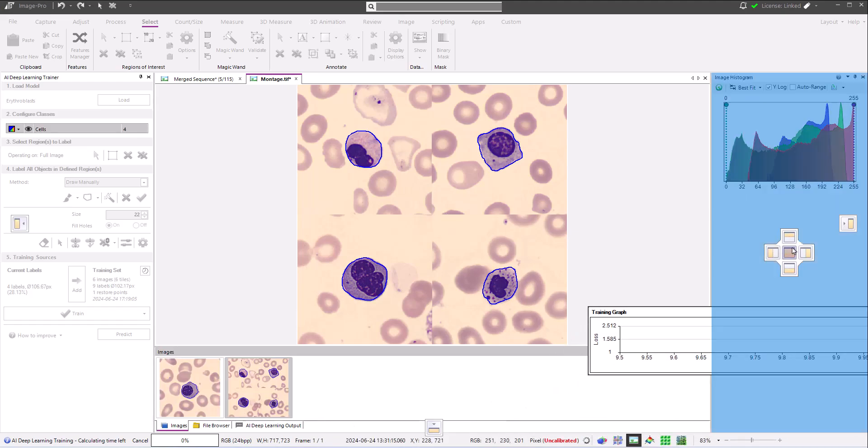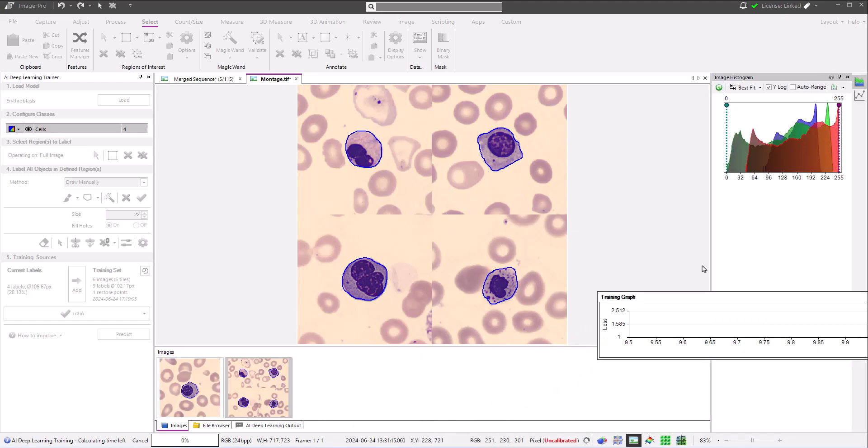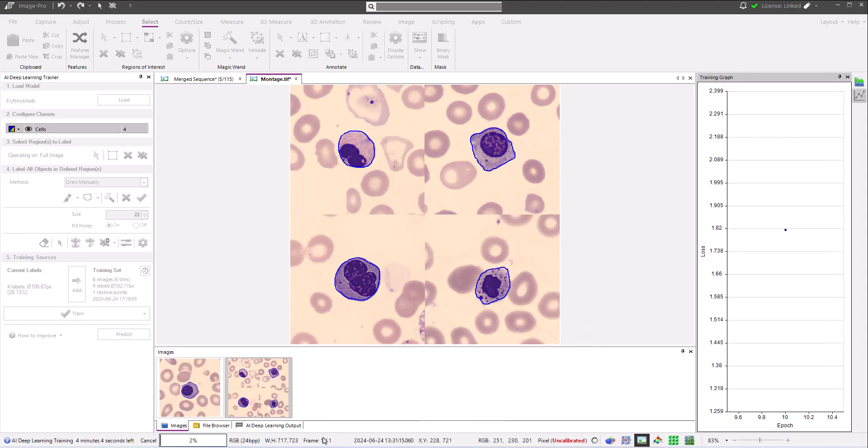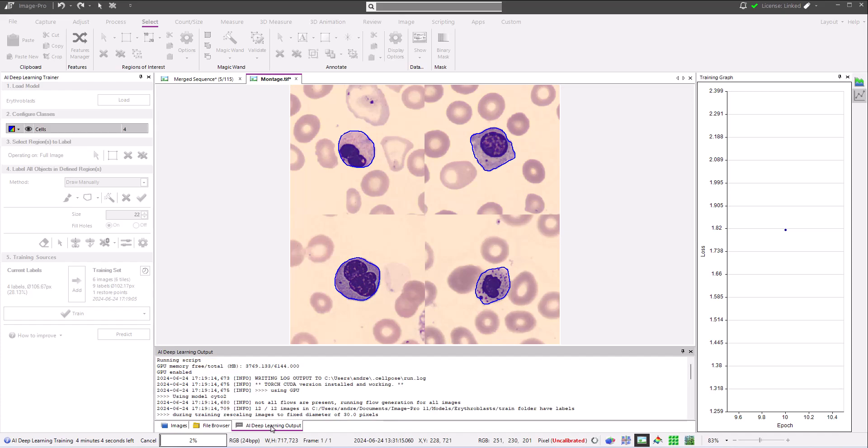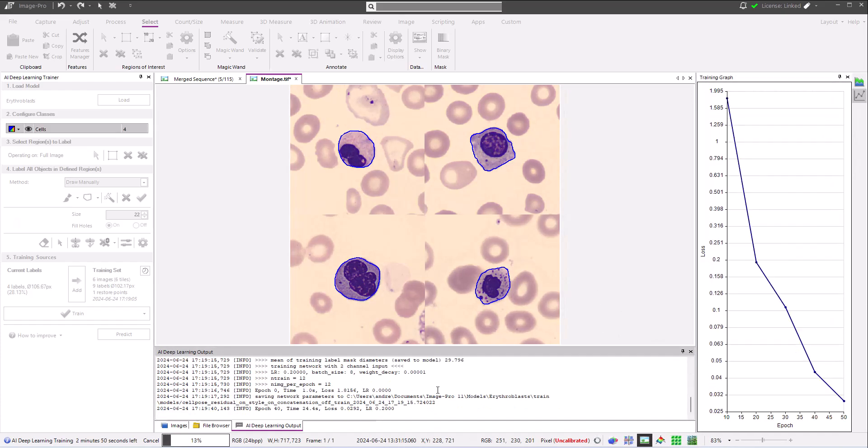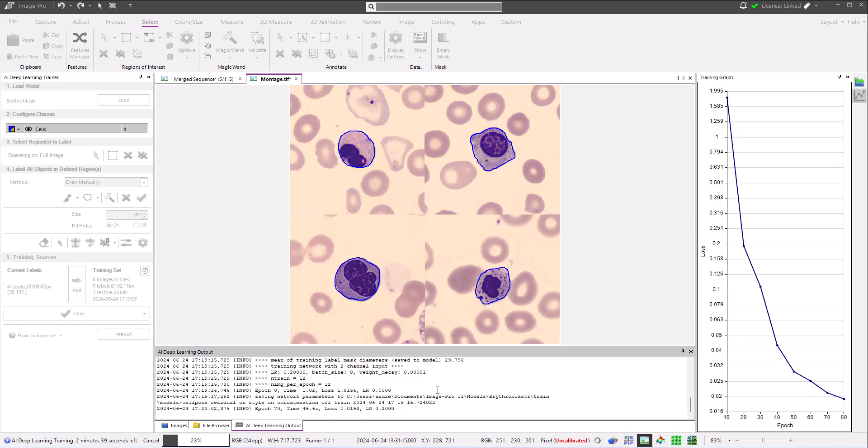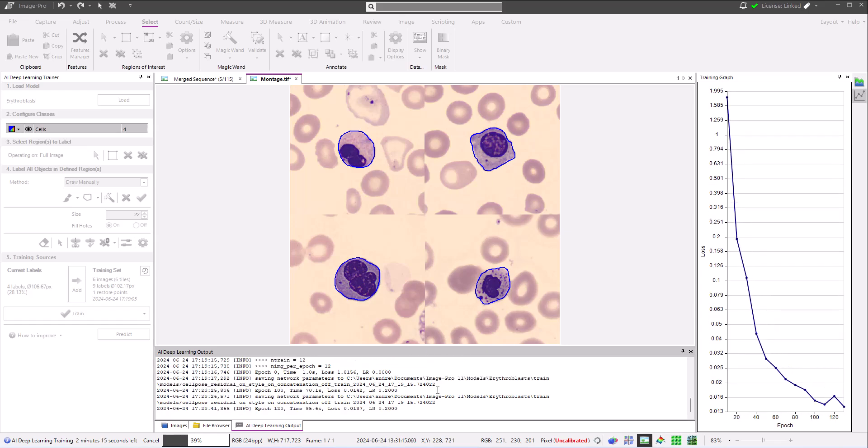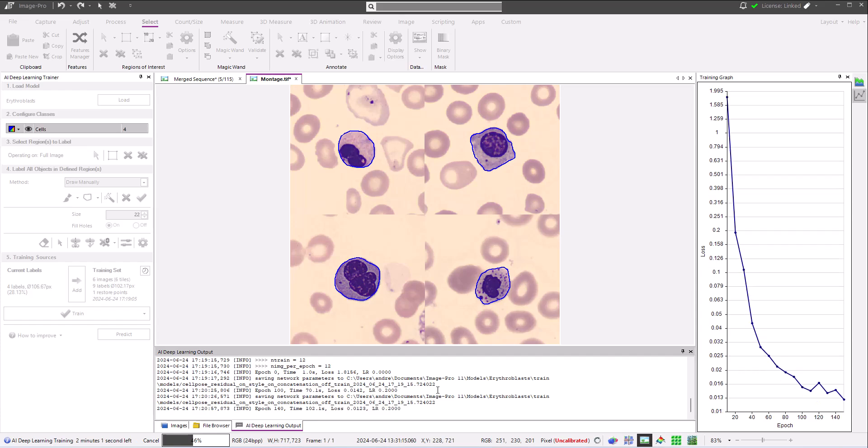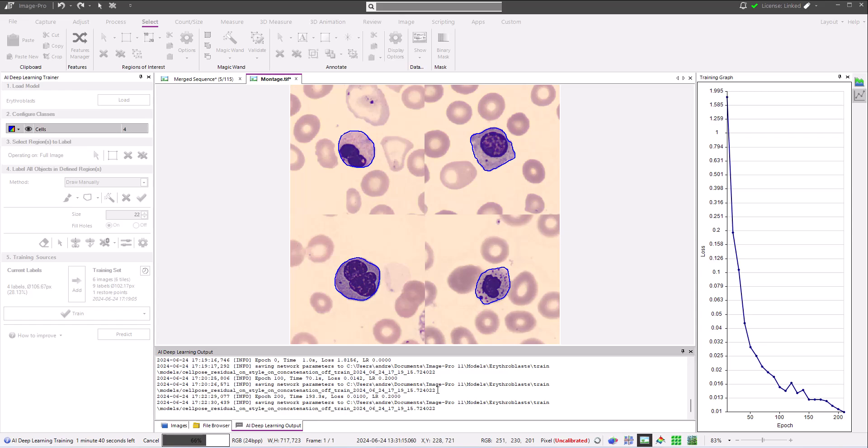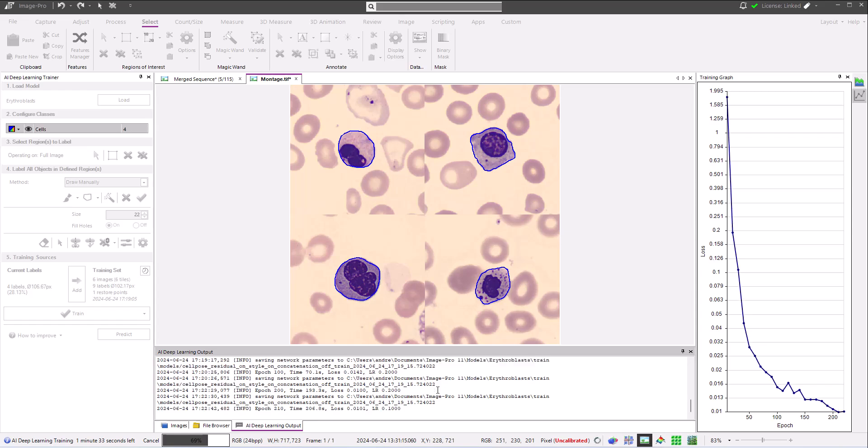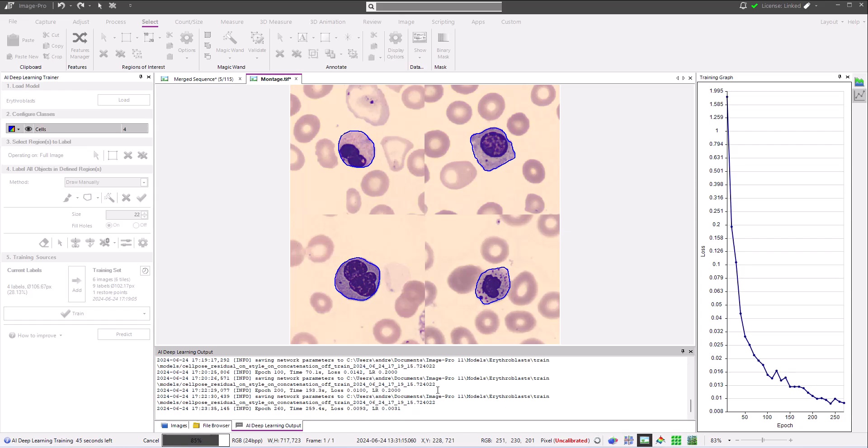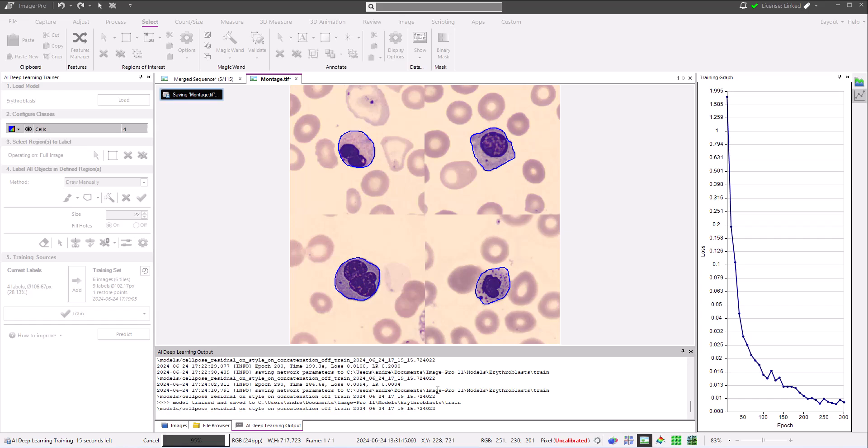During training, ImagePro calculates the loss function after each epoch and displays this value in the deep learning output panel every 10 epochs and plots it in the training graph. The loss function is a measurement of the difference between the training objects and the objects predicted by the model. The lower the loss function, the more accurate the model is. The training is shown speeded up for the purposes of this video. The loss function we see being plotted is actually very low, showing that the model is already very good. But we can put that to the test when the training completes.